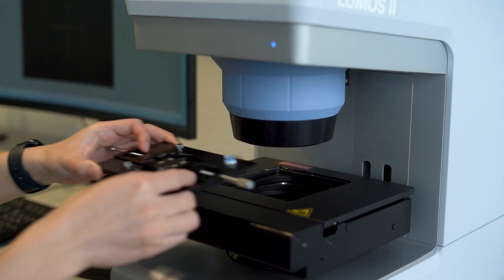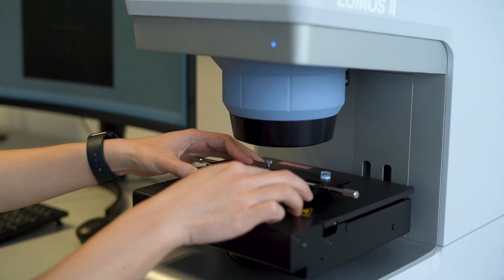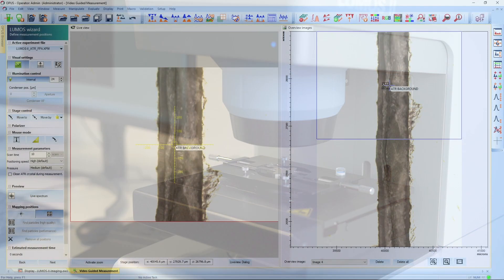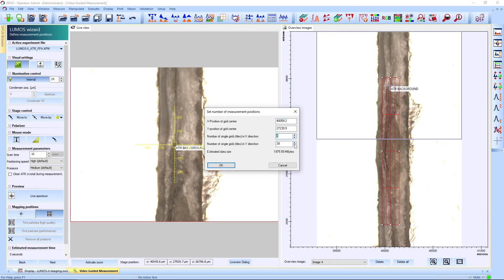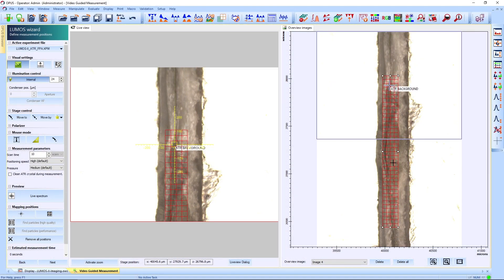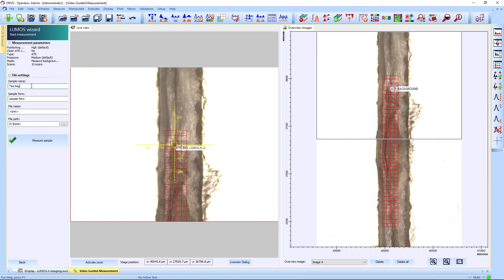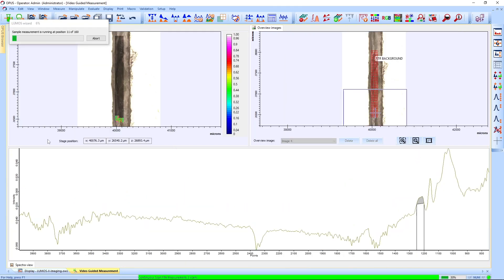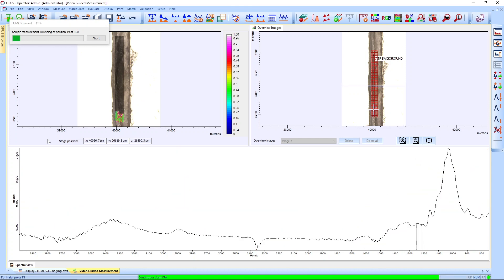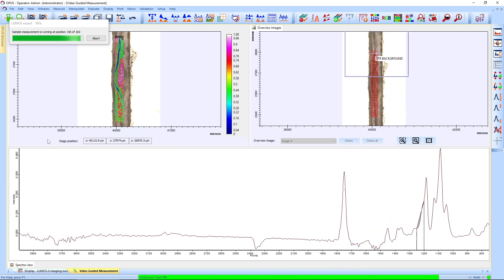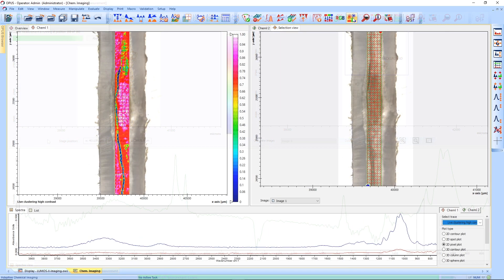After that, we slide it under the Lumos 2. Let's start the analysis. We place a measurement grid over the sample area and start collecting the data, which gets us the raw FTIR imaging data using the focal plane array detector.